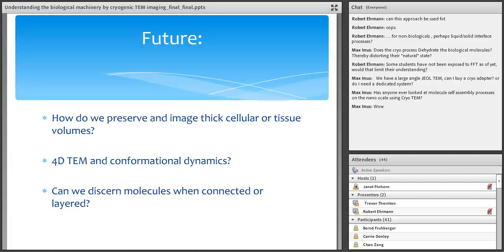And there's going to be a revolution in knowledge about the brain because of all the different optogenetic stuff that we've now developed and the CRISPR-Cas9 system, so we can do the transformation in recalcitrant cell lines that we couldn't do anything in before. And so how do we image these tissues as well? Because we can only image through a very small portion of the cell. We can't image through 50 microns. We can only image through a couple hundred nanometers at best. And so will we develop new imaging modalities using scanning transmission electron microscopy so we can see microns of thickness? Or do we figure out new ways to thin the cells in a way that we can then step through these volumes in a reasonable way?